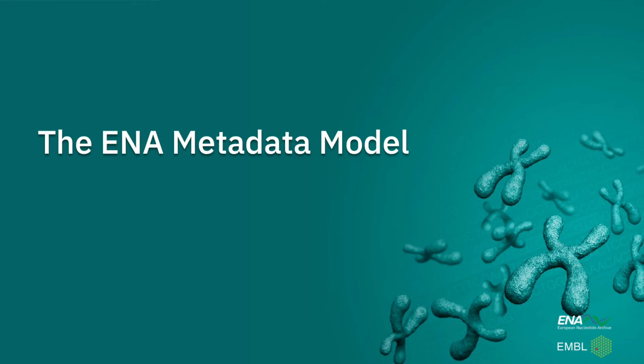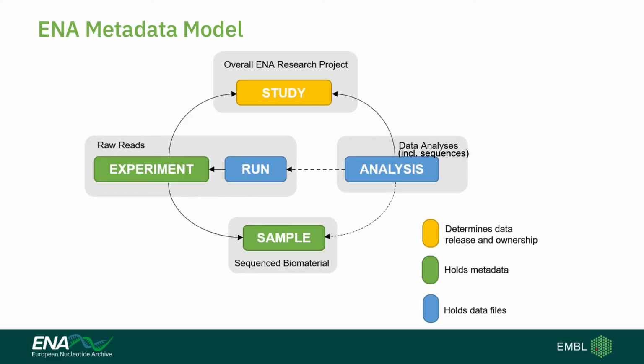So before we start submission, it's very important to understand how our metadata is structured and linked together. This model that I will present is actually the same model that's used for all types of nucleotide data across all species, which is why it's perhaps a little more complex than some other systems. But I think it makes a lot of sense in terms of how it's broken down into searchable objects.